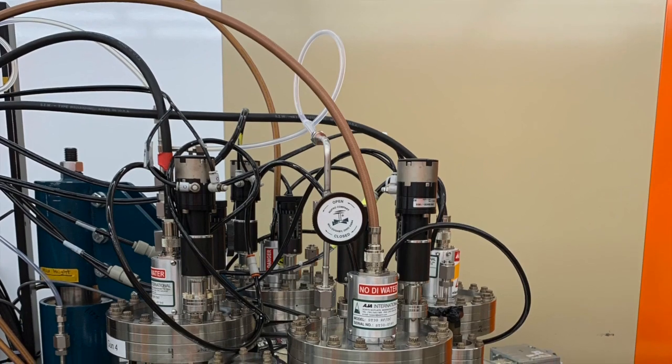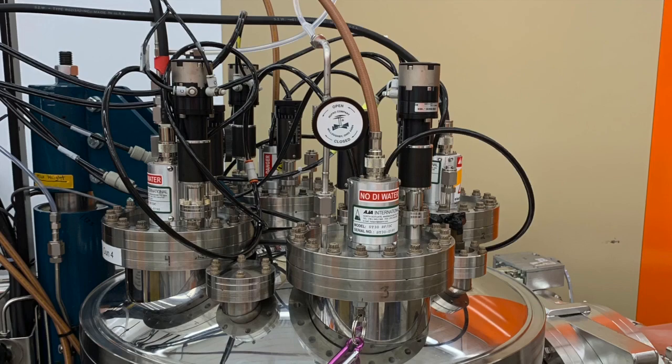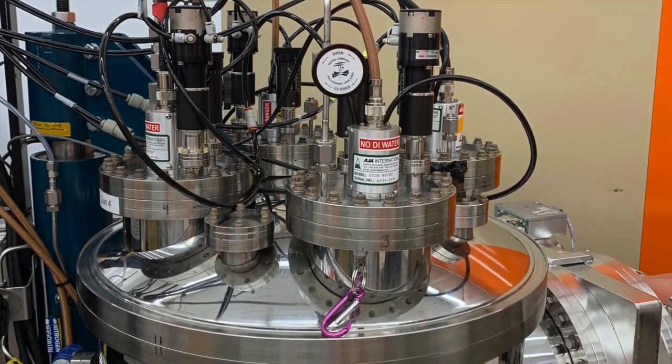What's up, everyone? Today we're going to take a quick look at magnetron sputtering and explain the process, as well as demonstrate how to deposit a thin film of metal.